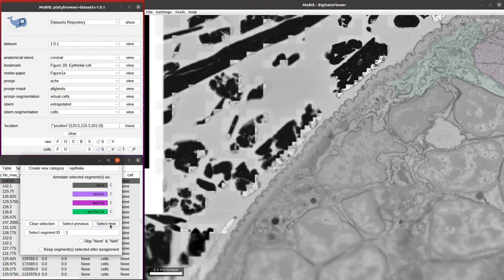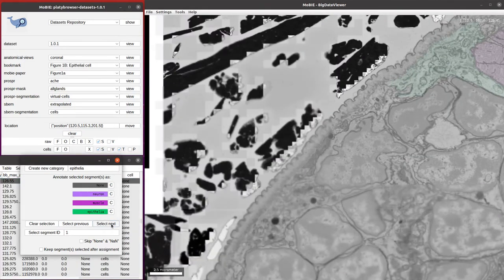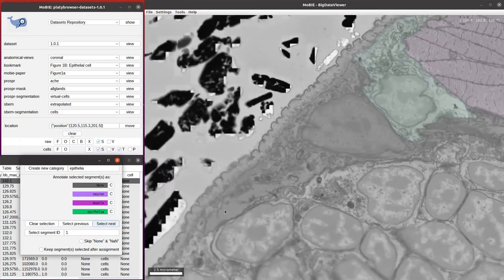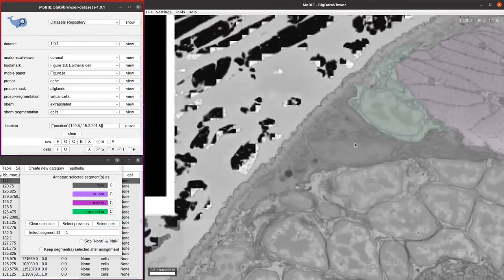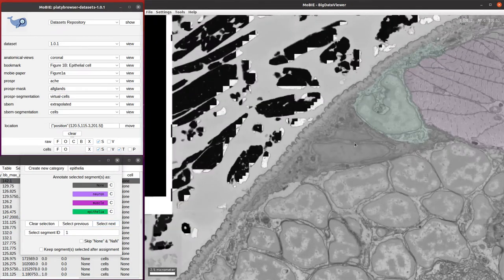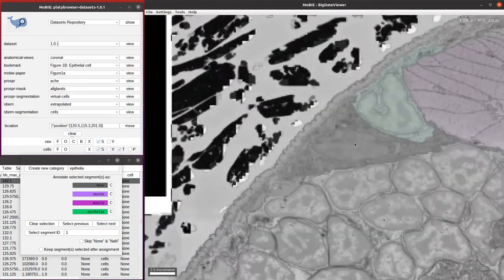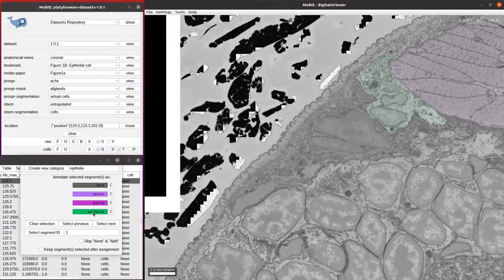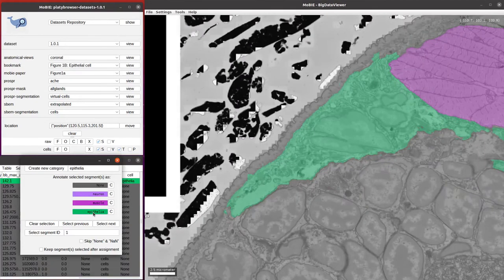When you click that, it'll automatically go to the next cell, and then you can look at it and figure out what it is. In this case, it's another epithelial cell. We can click the epithelial button and it gets assigned.